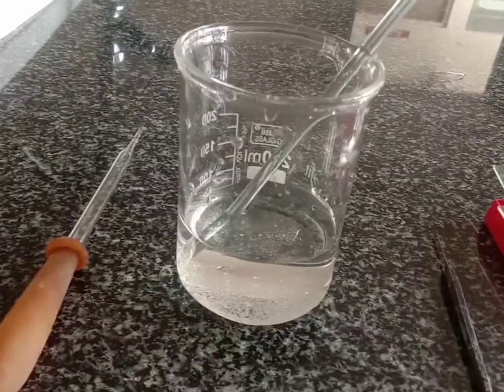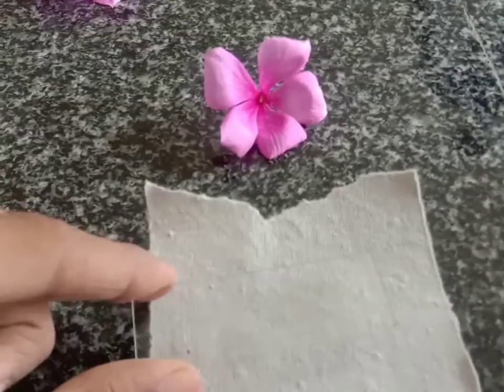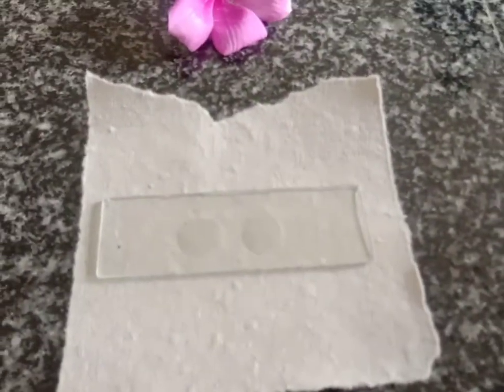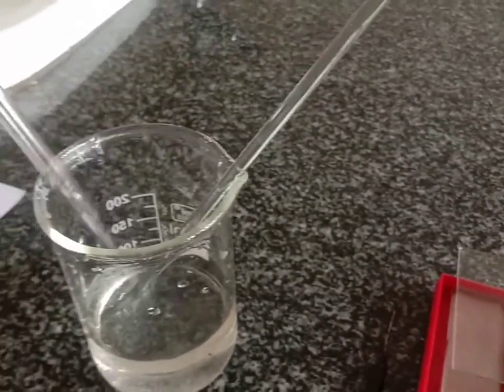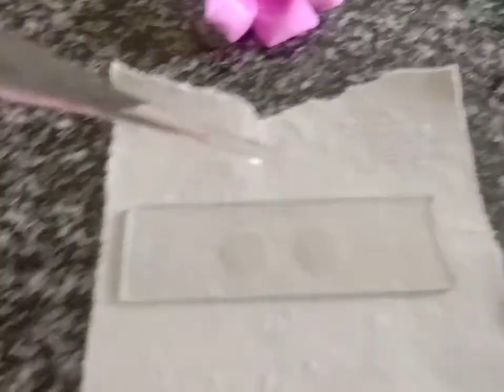You will also need a 10% sucrose solution. Let's see the procedure. Take a clean glass slide and add 1 to 2 drops of sucrose solution. This sucrose solution can be prepared using 100 ml of water and adding 10 grams of sugar.